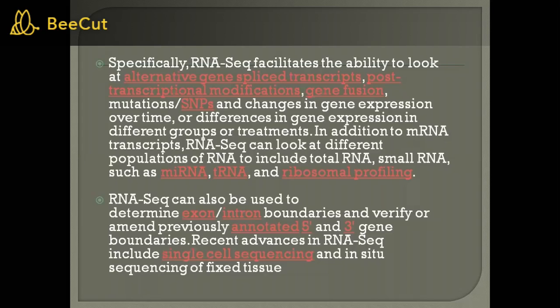In addition to mRNA transcripts, RNA-seq can look at different populations of RNA to include total RNA and small RNA, such as miRNA, tRNA, and ribosomal profiling.